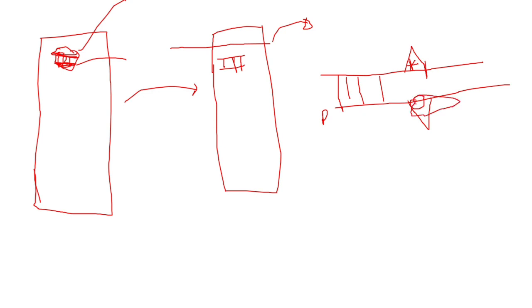In this way, we will be able to identify the mutations which have happened in the RNA.